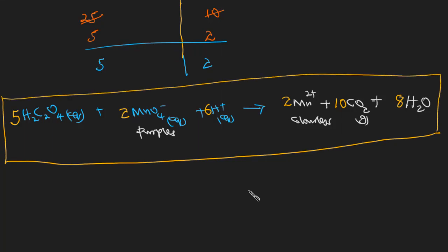We have even been able to balance it experimentally by getting the 2 mole ratios, the mole ratio of oxalic acid and of the manganate 7. The 2 are enough to give us the chemical equation, and that's how we can form a chemical equation by performing an experiment, and that is what we are calling stoichiometry of chemical equations.